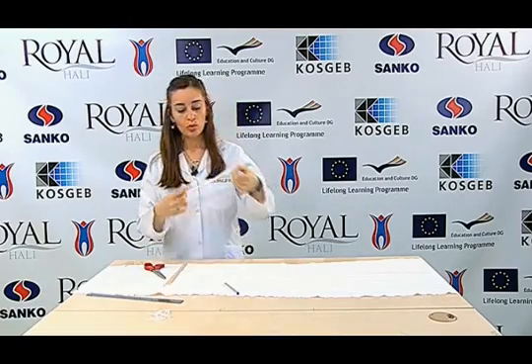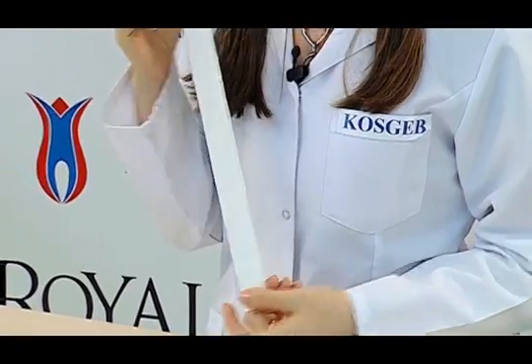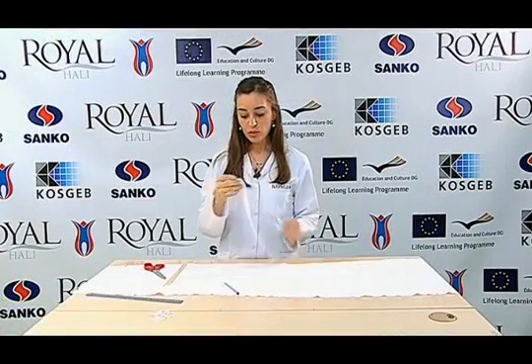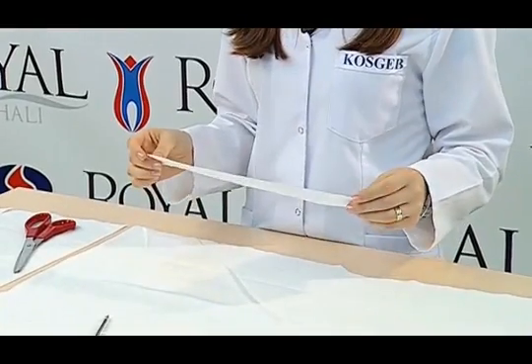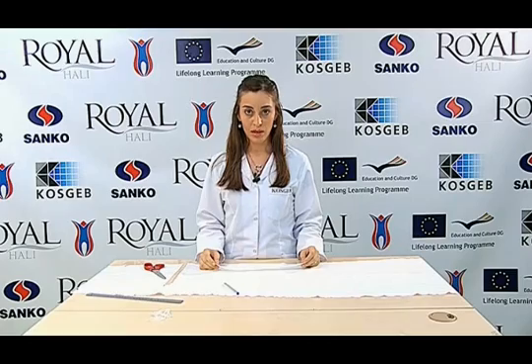Four bands with 20 samples are separately prepared for the warp and weft in the same way, making 40 samples in total. Then, four yarns are extracted, but the yarn extraction should be done during the application of the test in order to prevent twists from opening.